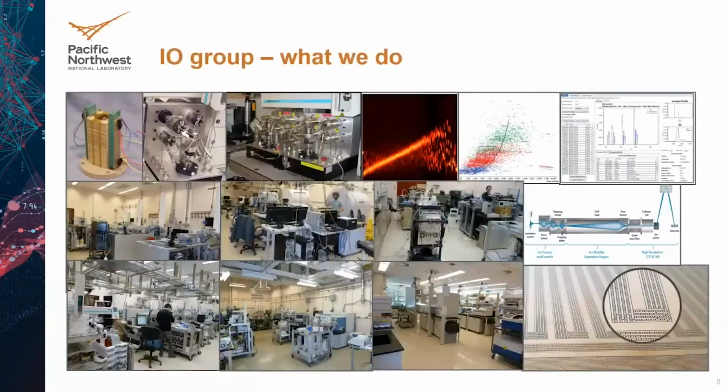And while at PNNL, I also had a strong appreciation for the finer points of different types of instrument development, whether it's on ion optics, like you see here with the ion funnel, or LC developments. These LC systems were all high-pressure systems, and they were developed several years before Waters then commercialized the UPLC system, and other companies have come on now with their own high-pressure systems. We've also developed software for treating the data, and now the group largely is moving more and more towards gas phase separations, ion mobility, and the IMS work has predominantly been led by Dick Smith, but also others in the group here as well.